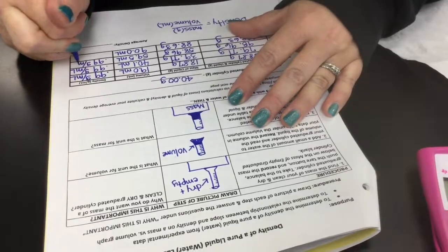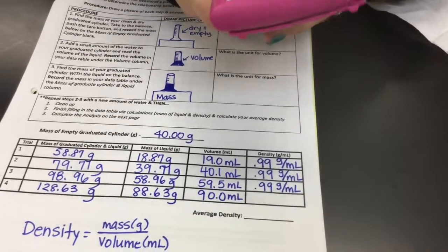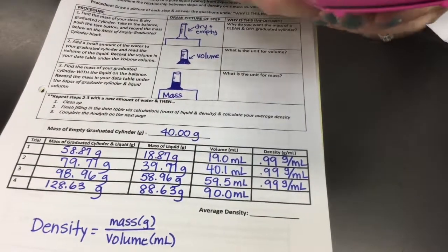How is this happening? I don't know. Maybe because we're using the same liquid. Maybe that has something to do with it. Oh yeah, we did use water the entire time.